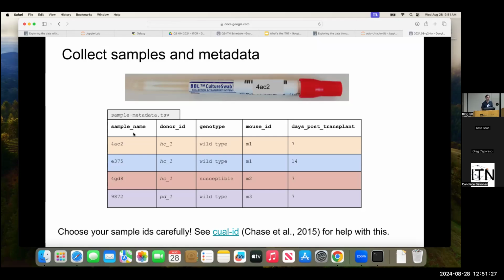And so if you're ever working in QIIME2 and you think, I need a new metadata file, or I need to make a copy of my metadata file, back up. You probably don't need to do that. Reach out if you have some questions, like great stuff to ask about on the forum. Like if you're wondering, how do I manage this? That's all fair game to ask on the forum.